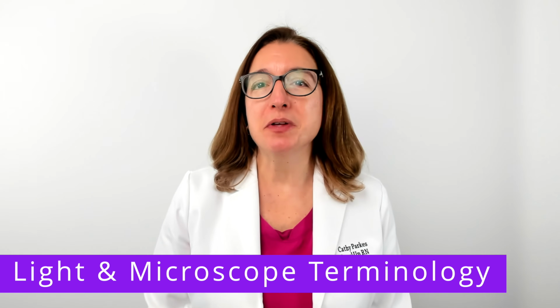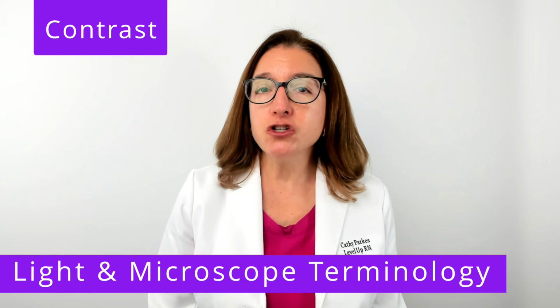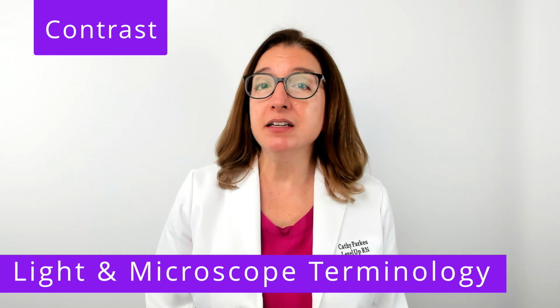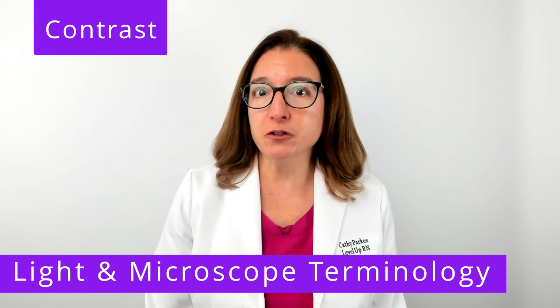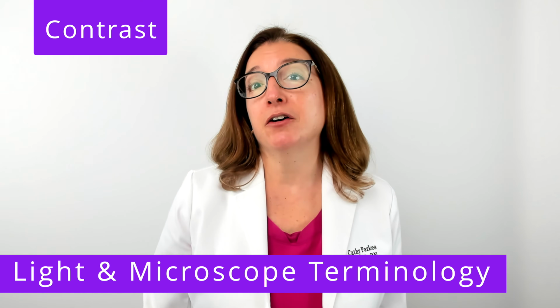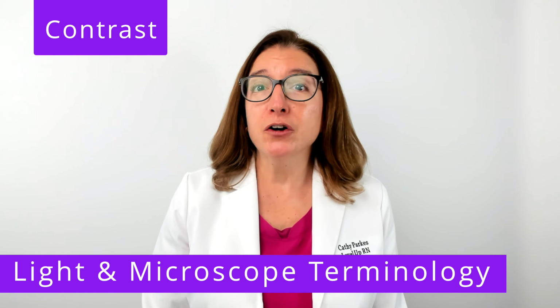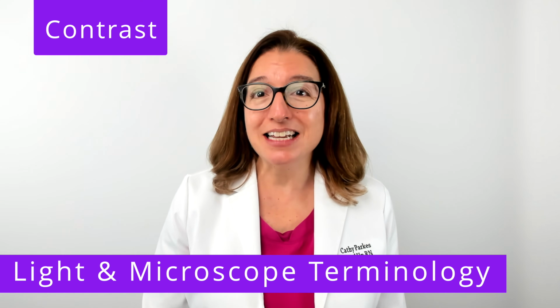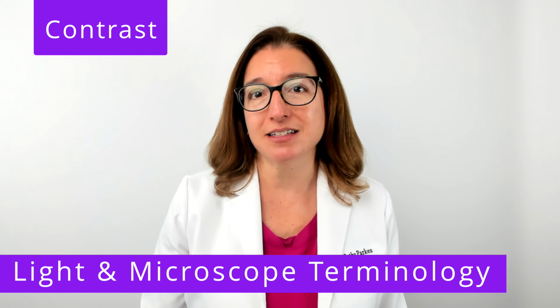Another term to be familiar with as it pertains to microscopes is contrast. Contrast refers to the ability to distinguish different parts of a specimen. So certain microscopes, such as a phase contrast microscope, are going to provide better contrast than a Brightfield microscope. However, we can use dyes and stains when using a Brightfield microscope to help improve contrast.